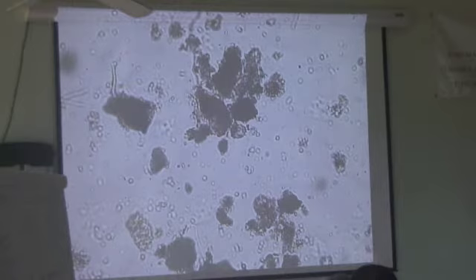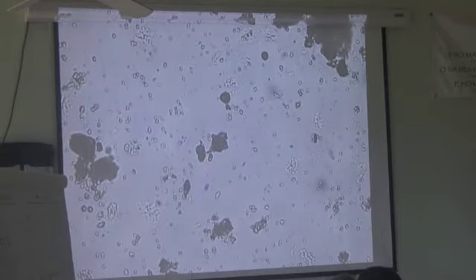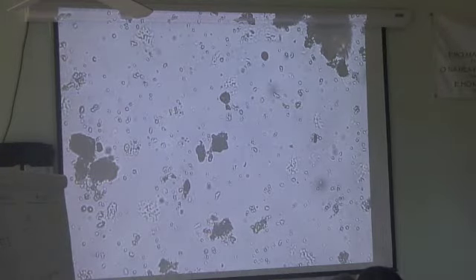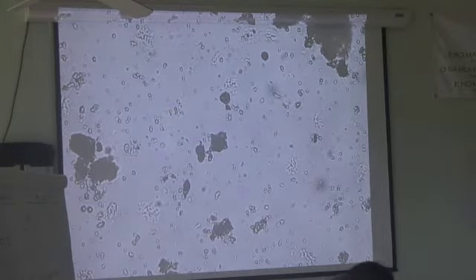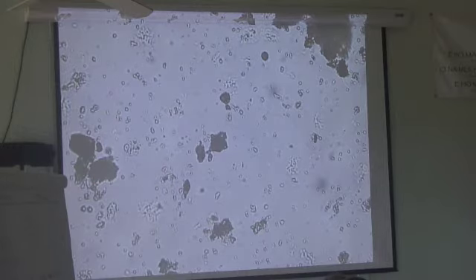We record all of this data. We then want to move on to the next field of view, and all I'm going to do is go down. So, here's my slide, here's my cover slip. We started here, I'm just going to move down a ways. Not going to be looking through the microscope because I know I would choose a field that's got the most interesting stuff in it. So you can't be looking. Close your eyes or something. So here's my next field of view. We're going to start counting.